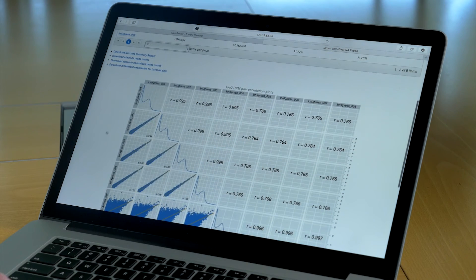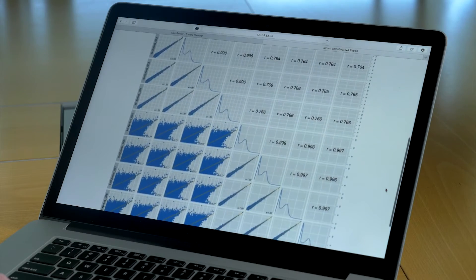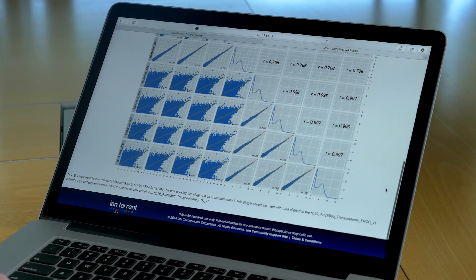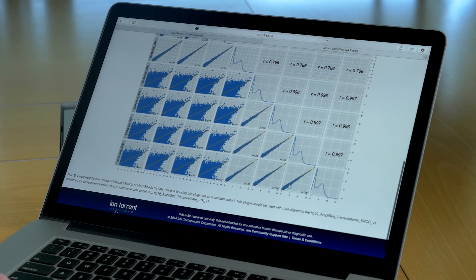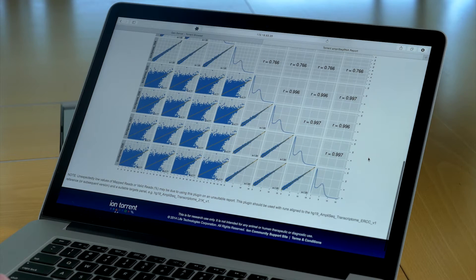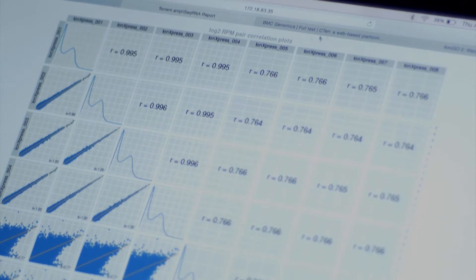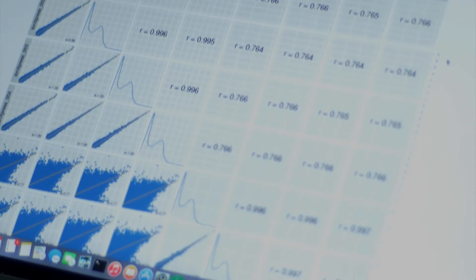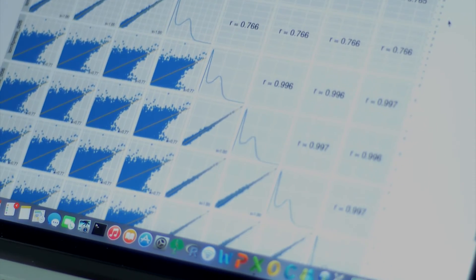When multiple samples are run simultaneously on a single chip, all multiplexed and barcoded samples are plotted as pairwise comparisons. So replicates should display high correlation coefficient values, as shown here in the upper left and lower right quadrants.